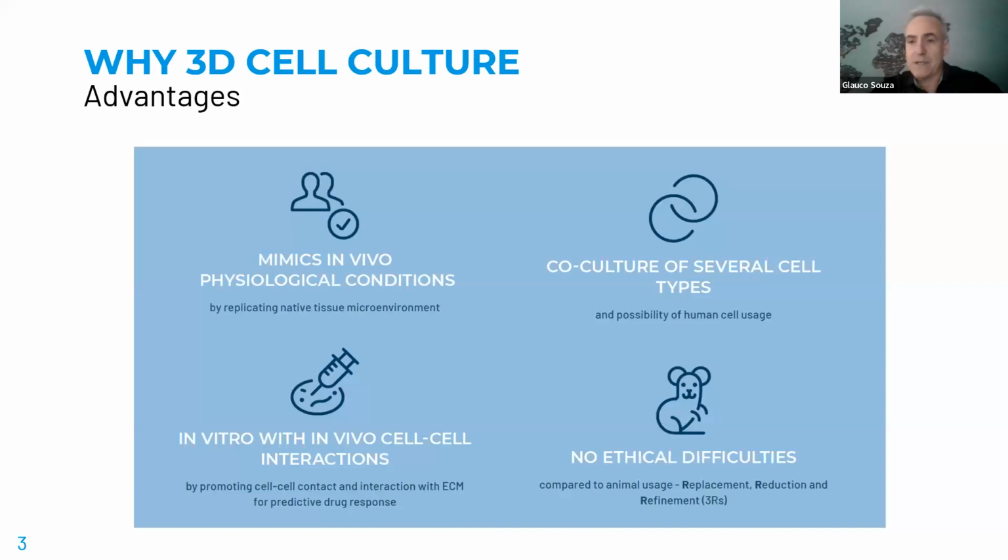And if you're developing a diagnostic test, if you're developing a tissue model, you want the tissue to be predictive of in vivo biology. And today we know when cells grow in 3 dimensions, they better represent how cells grow in vivo in the body. And again, when the cells grow flat, they only have contact with plastic. In 3D, they have cell-cell interaction, and they have the 3D space to interact and grow more like in vivo.